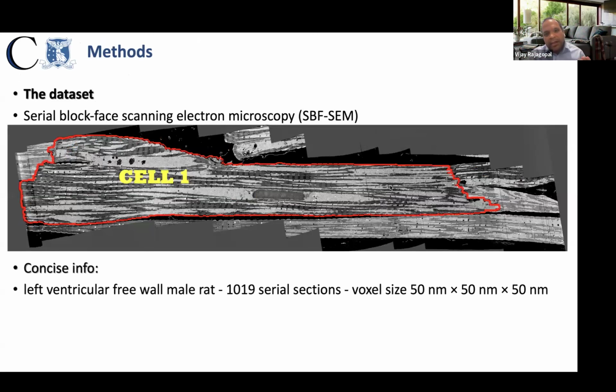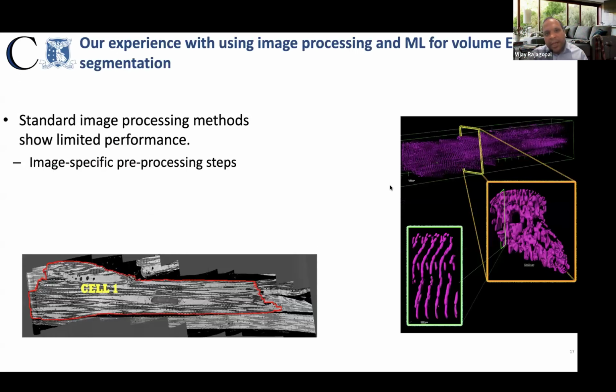A little sort of fast forwarding here so that we have time to get into the AI. We spent about 2 years developing image processing algorithms. This is back in 2015, maybe 16, it might even be 17 actually. We did some image processing based methods to segment these Z discs. And Afshin, who did all this work, really worked hard to develop an algorithm that would track these Z discs, and what you see on the right is an output from his work.